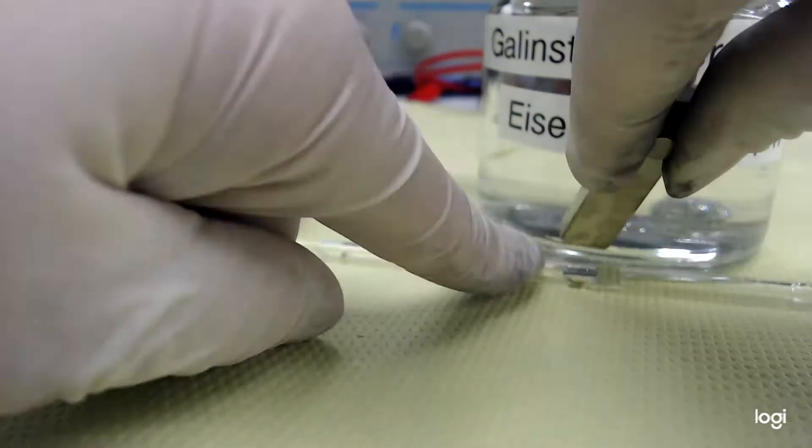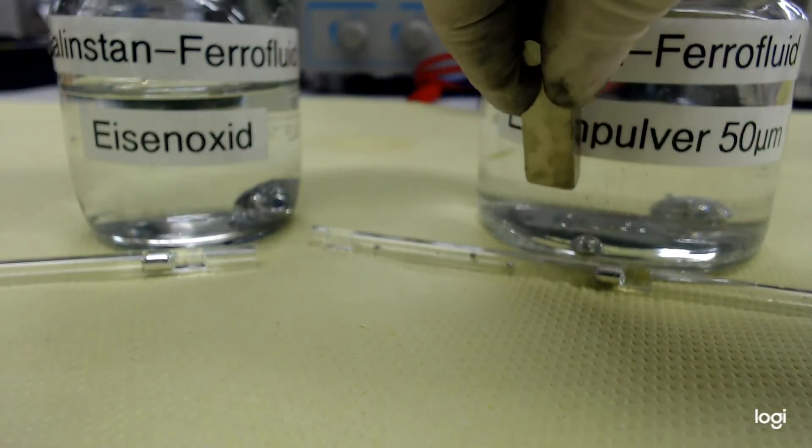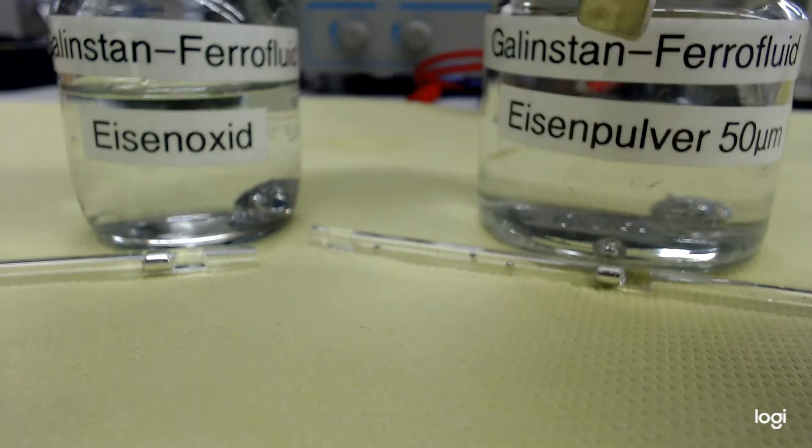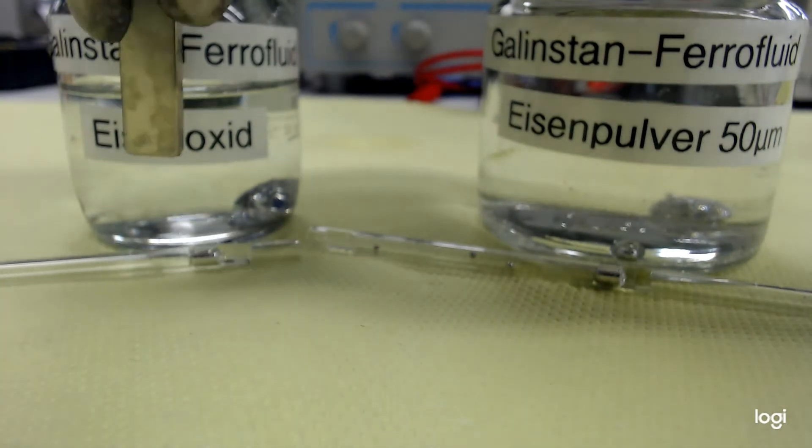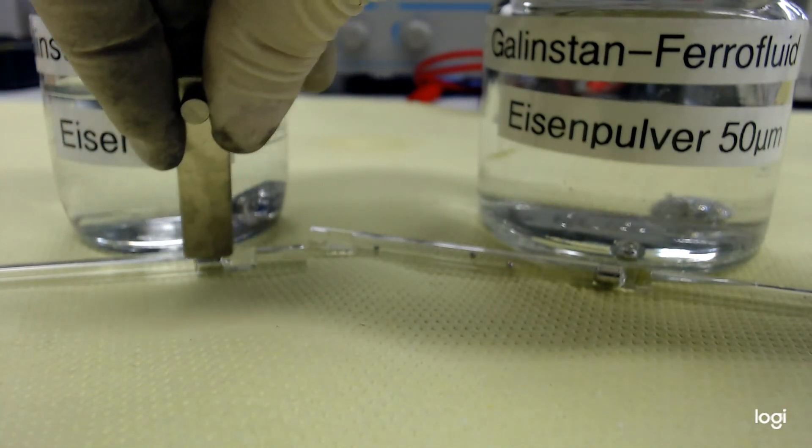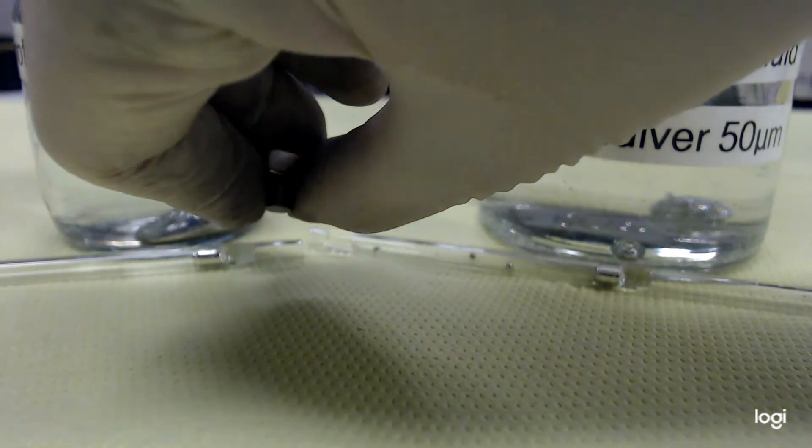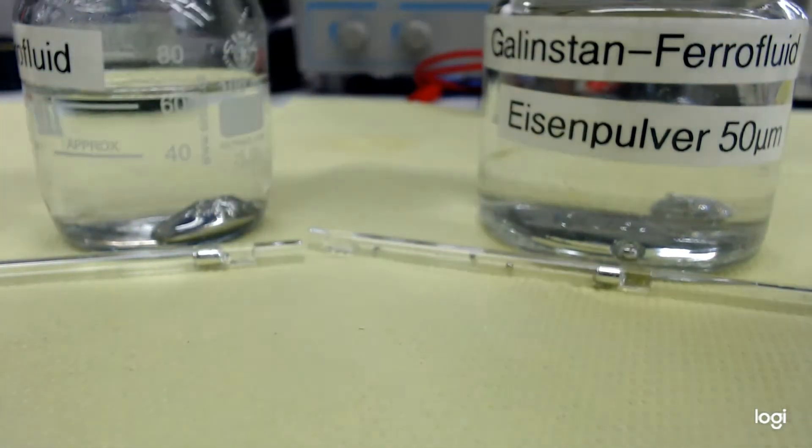Here, the iron powder has formed an alloy with the Galinstan and it can transfer magnetic properties to the full liquid metal. So in the case of the iron oxide powder, it has probably been completely washed out of the Galinstan and is no longer contained in the liquid metal.